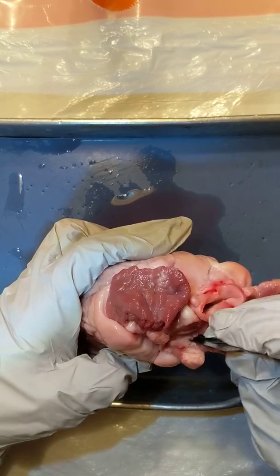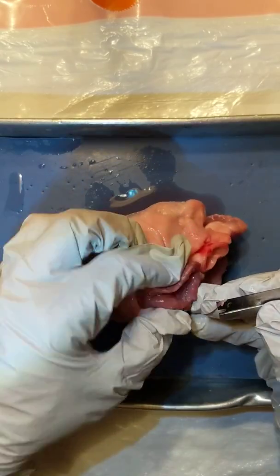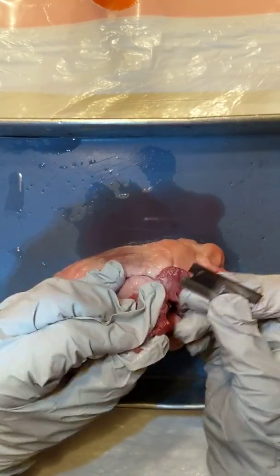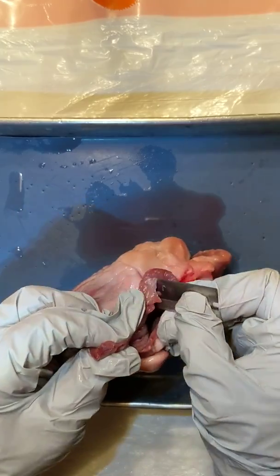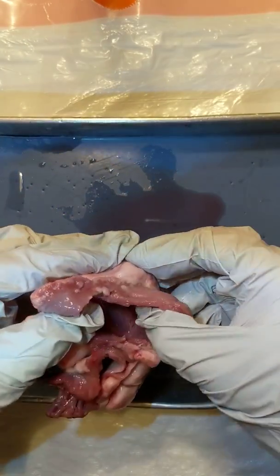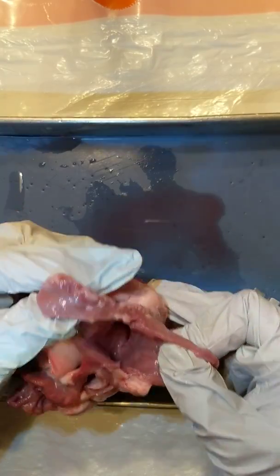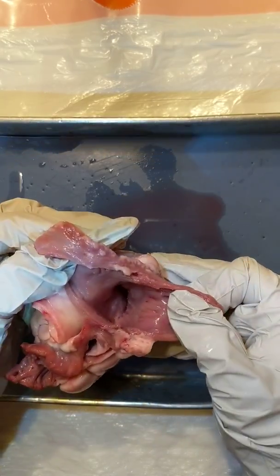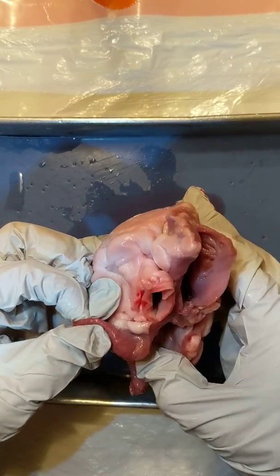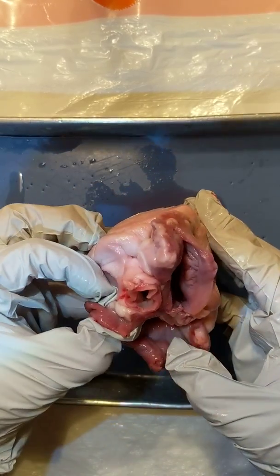Cut open your atria, and I'm going to cut open the left side too. You want it cut far enough open that we can look down into the heart and see what's going on. I can see into that side and I can see into this side.